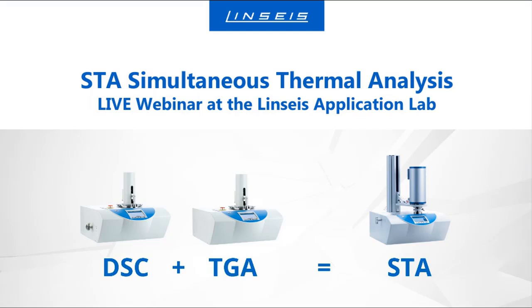Okay, today's topic is the STA, which means simultaneous thermal analysis. So it's a combination of calorimeter DSC and thermogravimetric analysis TGA, and together it forms the so-called STA.